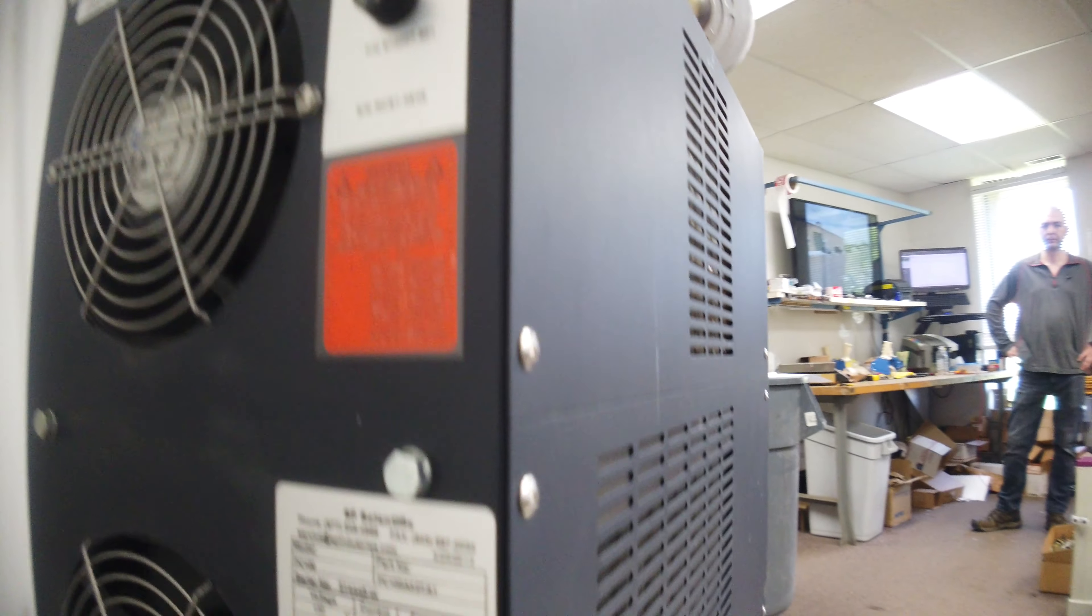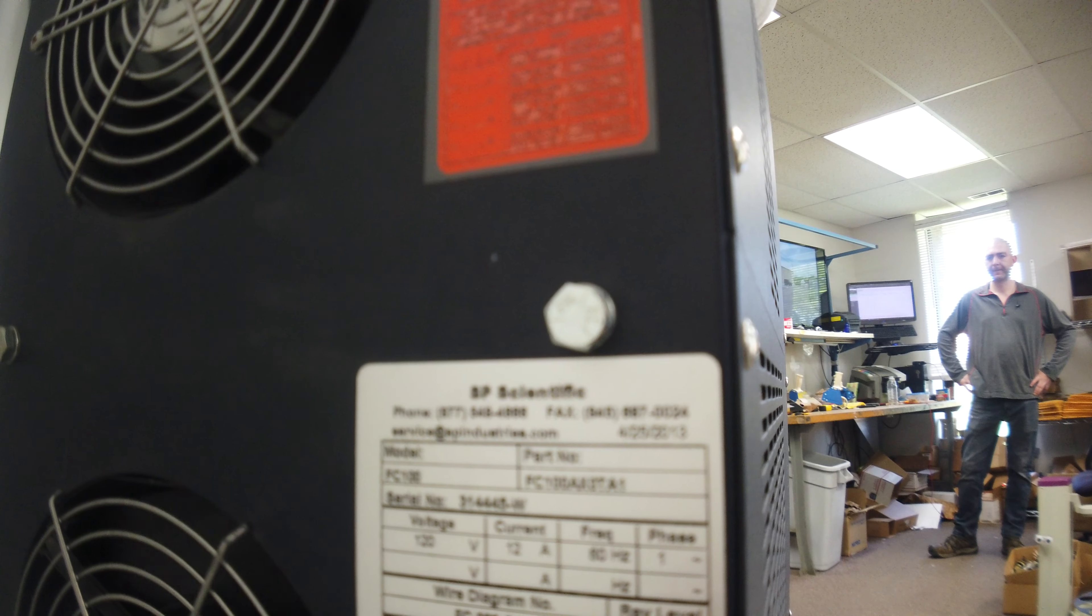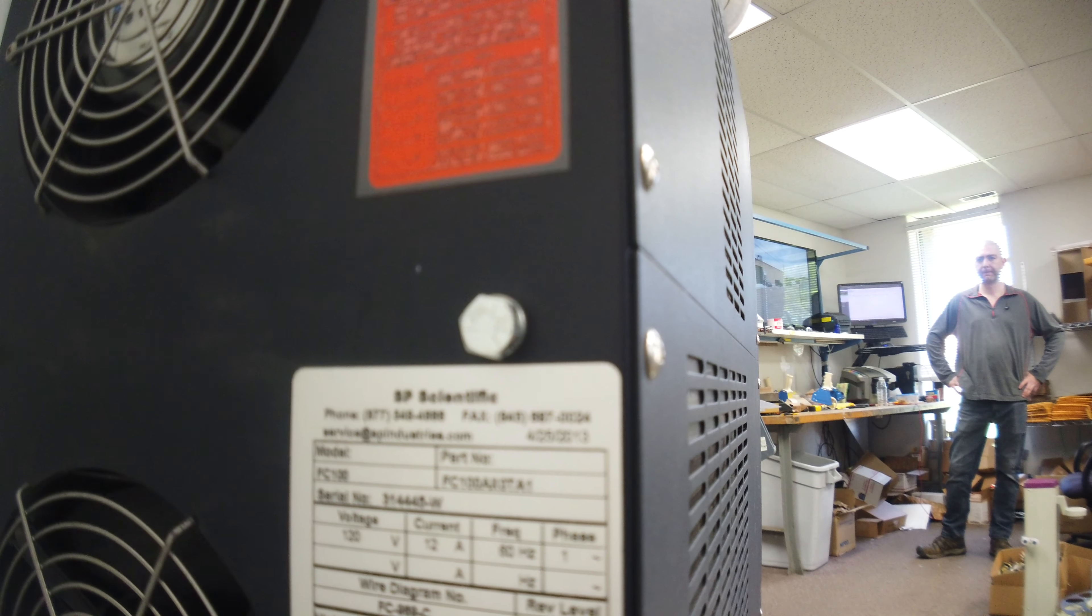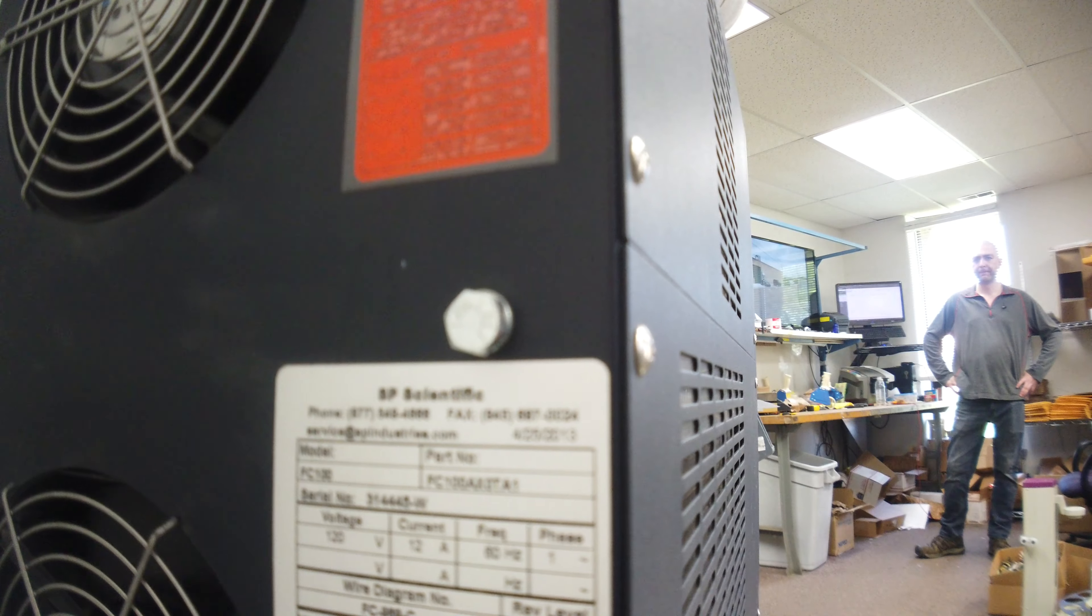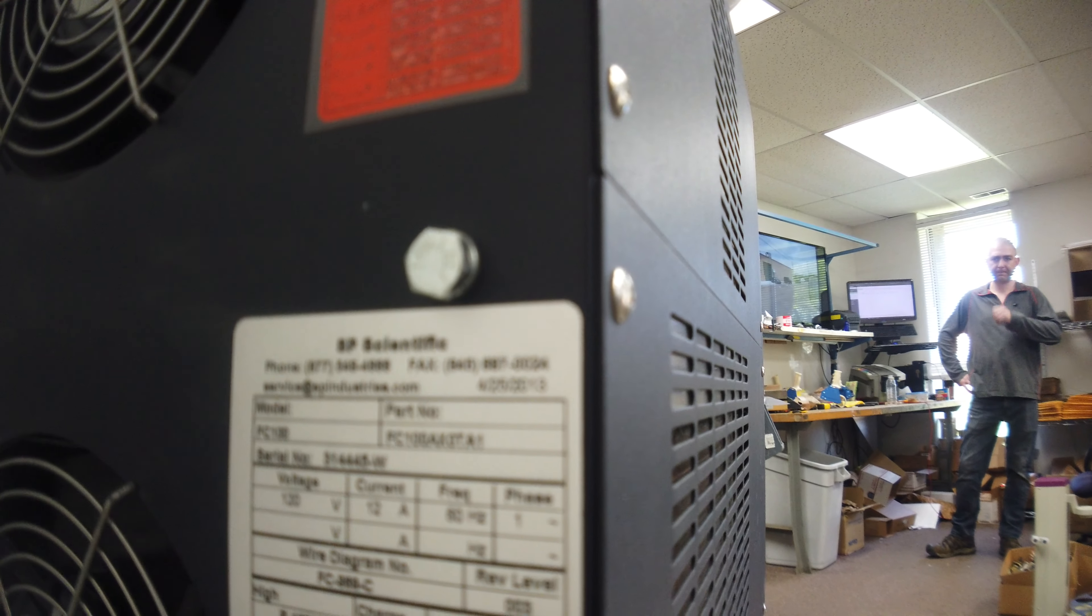But it really doesn't come up with much. But this piece on the back here, SP Scientific, FC100, FC100AX0TA1.